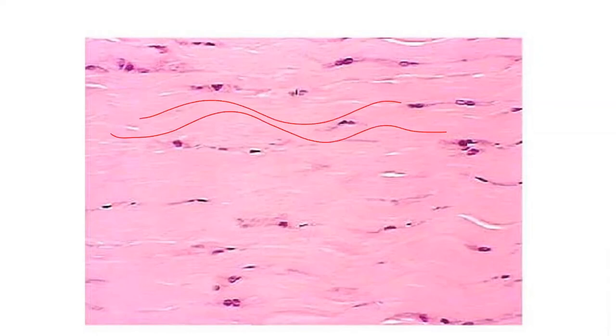What sticks out here? Wavy bacon. These long, regular collagenous fibers. Some dark stained nuclei of the fibroblasts. So this is connective tissue for sure. And more specifically, it's dense, regular connective tissue. It's the wavy bacon trick.